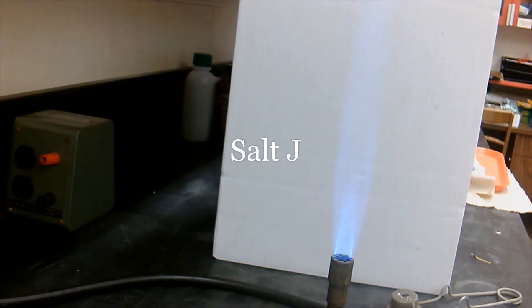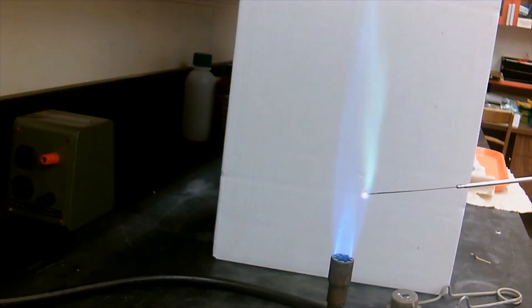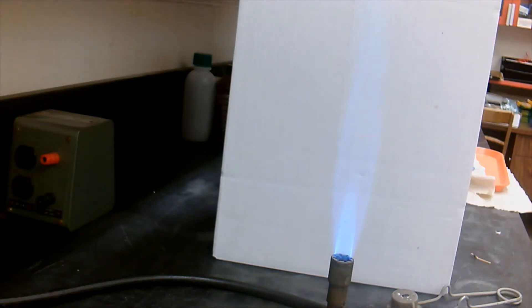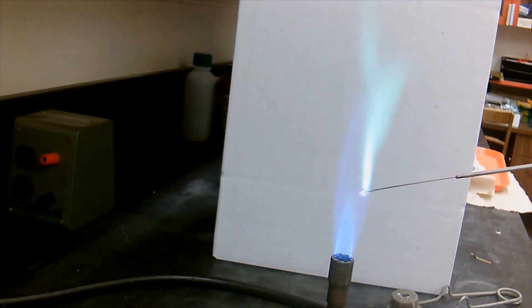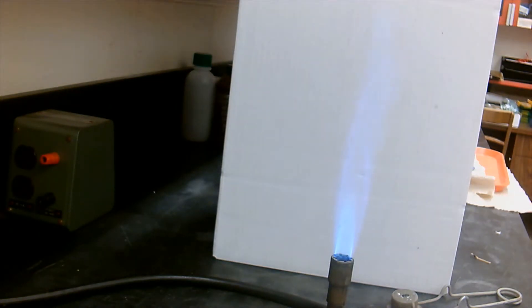Let's try to see the color. I have here the solution on a little metal loop. Let's try it again. Let's see what color. What color do we see? I see kind of green, right? There we can see the green. Not for a super long time, but we can actually see it.